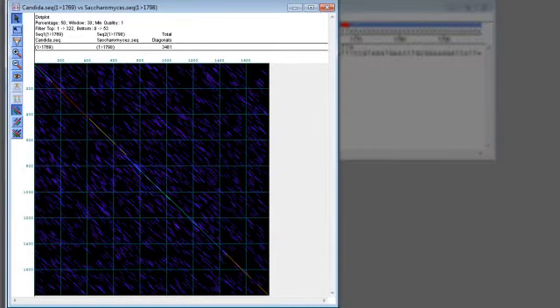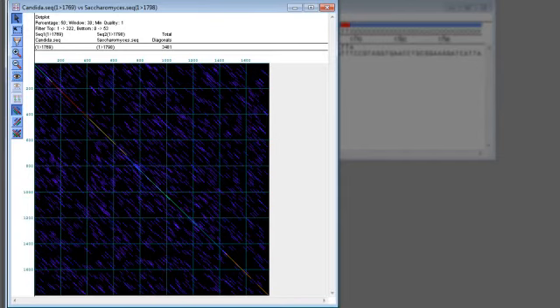Here each axis corresponds to a single sequence in the alignment, and the diagonal lines represent portions of those sequences that align to one another.